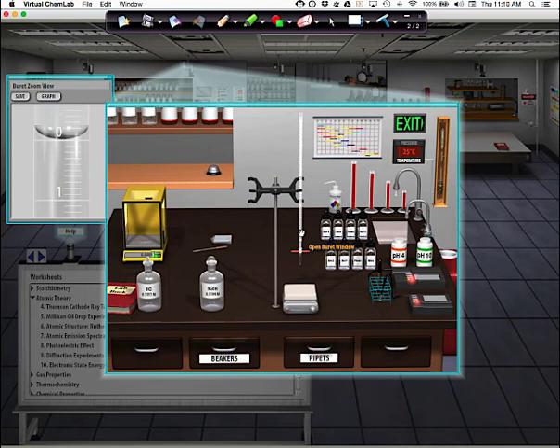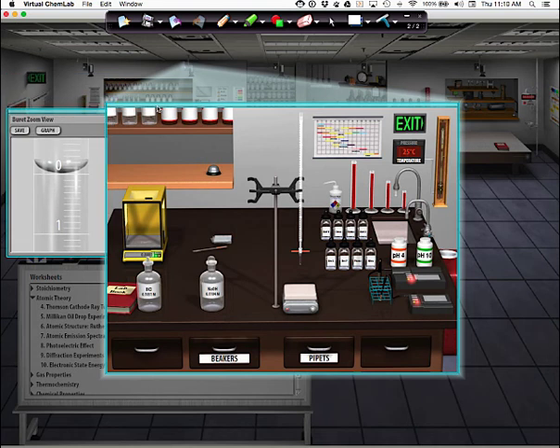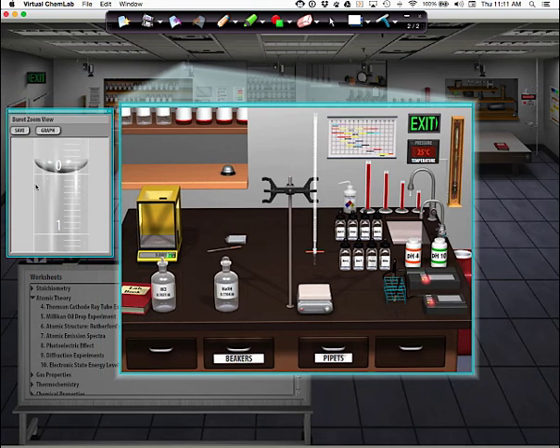Now guys, here's the thing that you didn't know. I had the mouse button clicked the whole time. You need to write that into your lab. Guys, for step 10, hold the mouse down. Just write down, hold mouse down, or hold button down. Because it's not like that for any of the other glassware. The burette is the only one that you fill by holding it down.